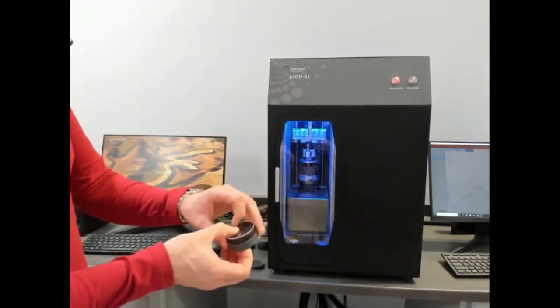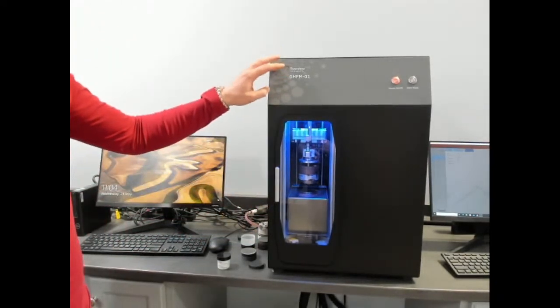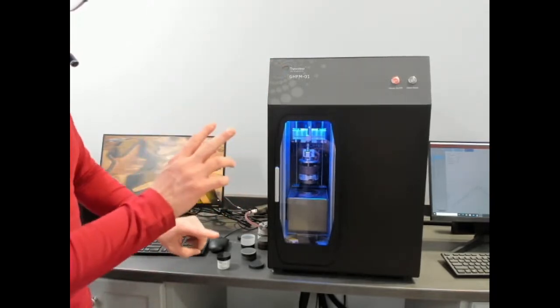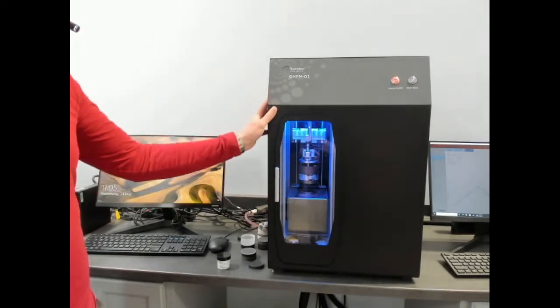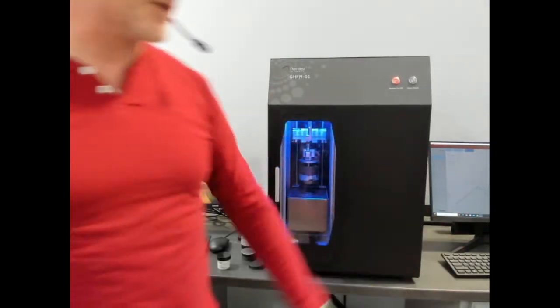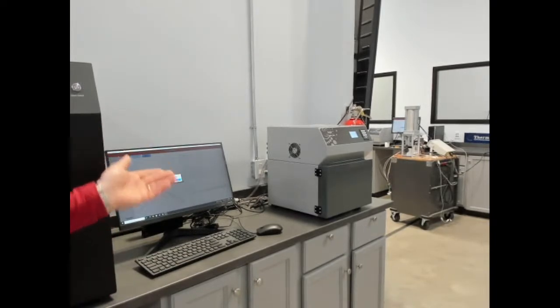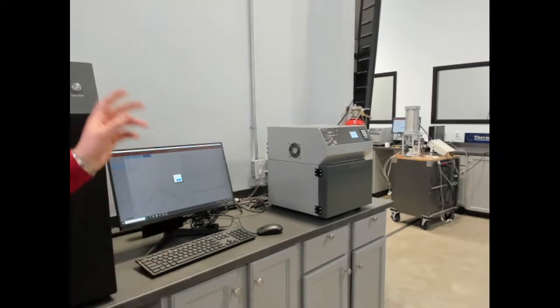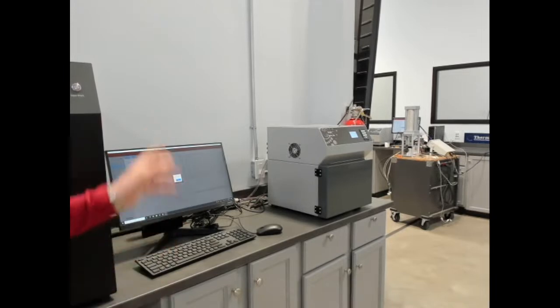And that can be done over a temperature range of minus 20 to 310 Celsius. Actually, that's the plate temperature range. The mean temperature range would be based off the delta T that's on each side. So again, this is guarded heat flow meter following ASTM E1530. And then our other steady state device, which is our HFM 100, that's for measuring construction materials and insulation according to ASTM C518. We have 2 sizes of that, the HFM 50 and the HFM 100. I invite you to learn more about that in one of our other demonstration corners.